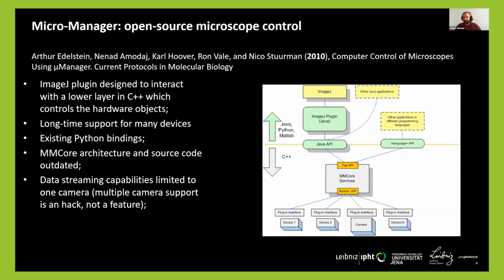So this became one of the most important tools in open source microscopy, because it received the most contributions, also from companies, and it has the richest library of device adapters that we currently have at our disposal.